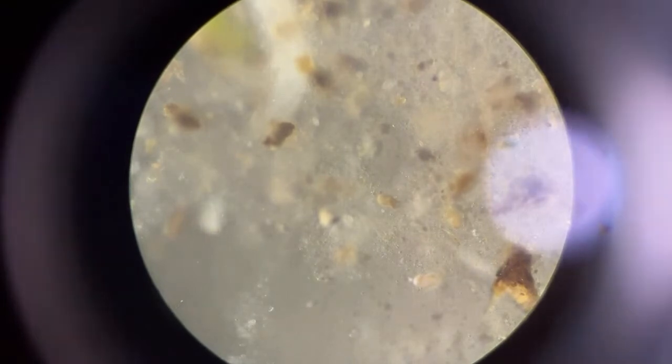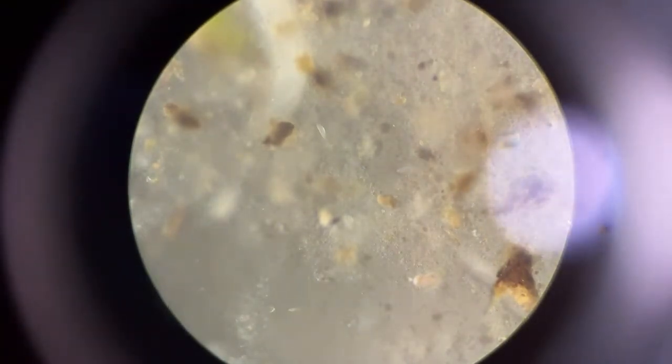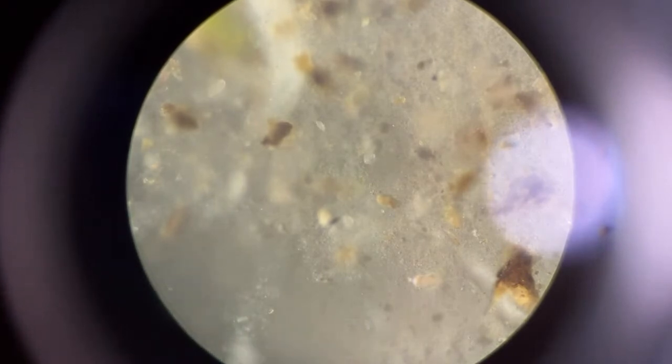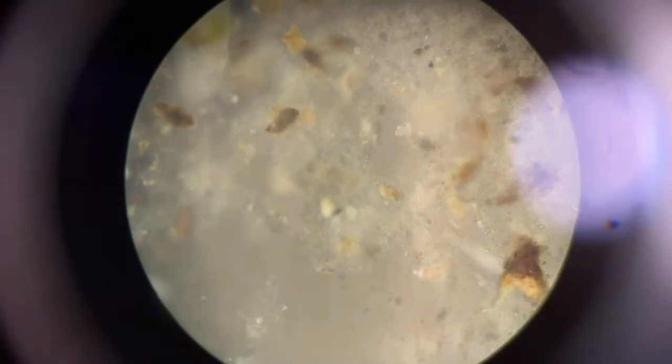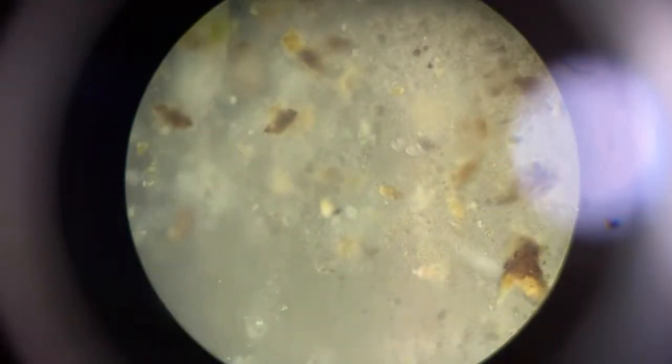Okay, so now that we have this basic setup, let us probe into the world of this little water puddle. Remember, what we are seeing is through direct reflected light, and therefore the color would be real, as we would have seen with normal daylight. The views would be more realistic, not like an X-ray.